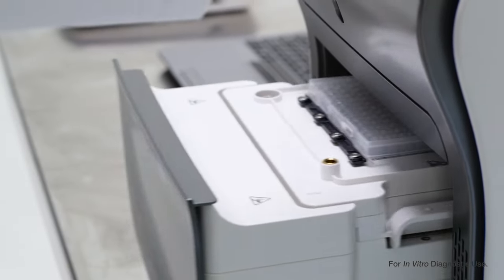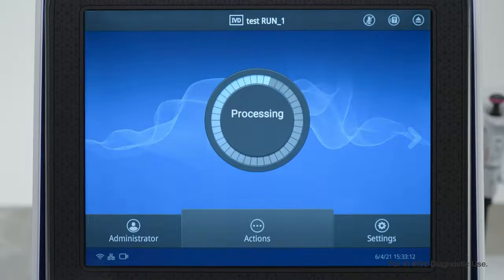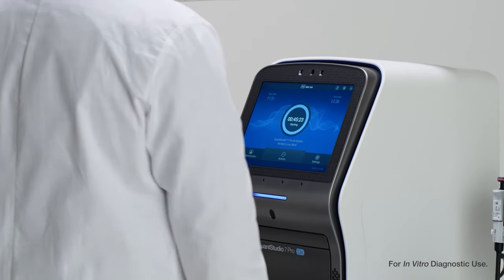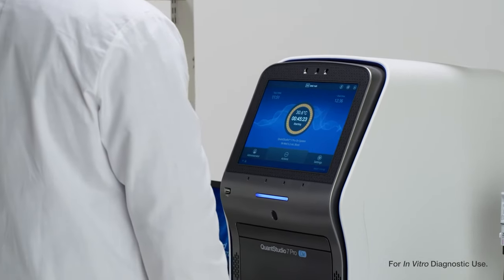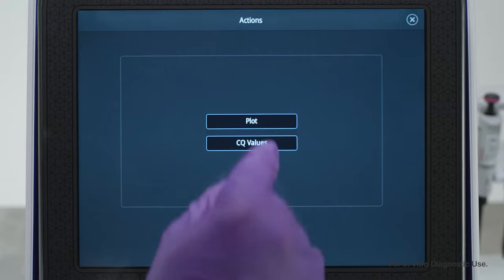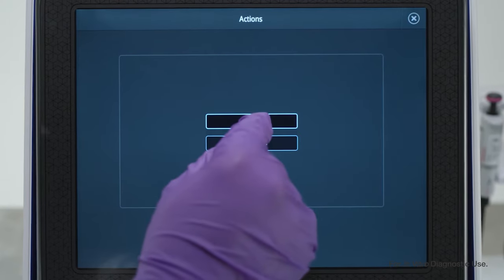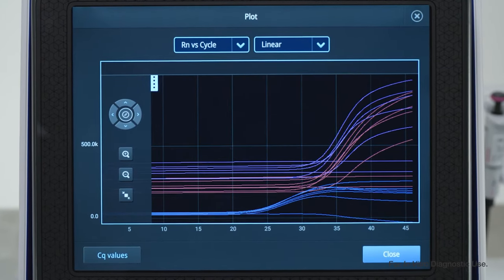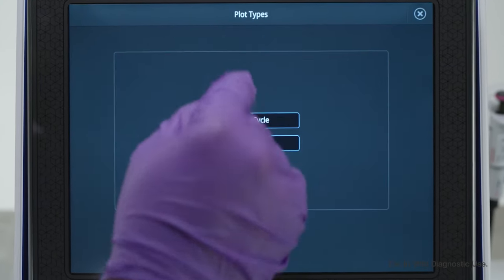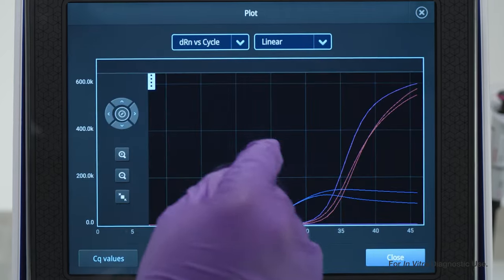Once configuration is complete, load the plates and your run can begin. And when the run is finished, you can perform primary and secondary data analysis directly on the QuantStudio 7 Pro DX.